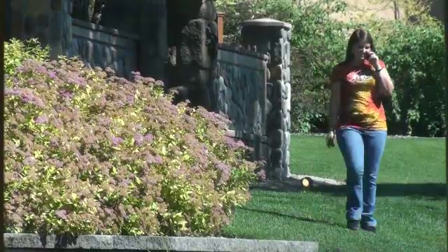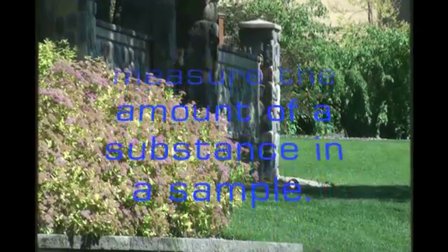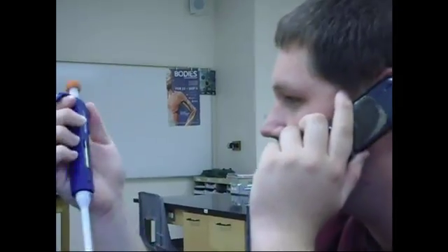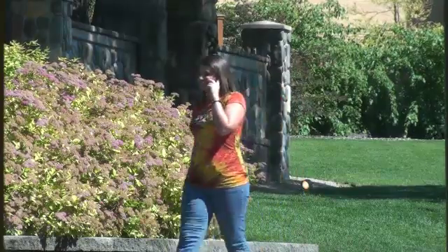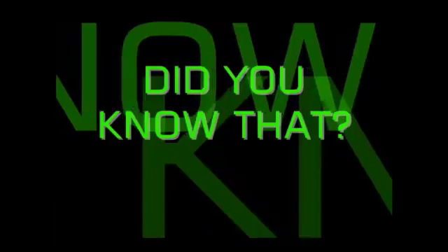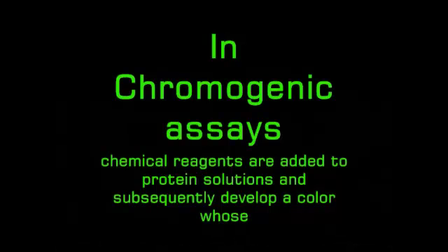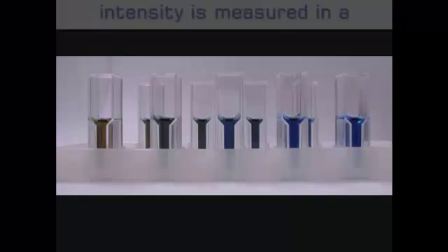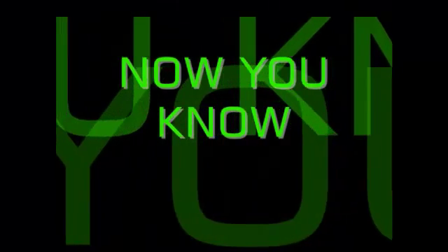It says I have to do something called an assay. Do you know what an assay is? An assay is a way to measure the amount of a substance in a sample. The one you're working on is for protein quantification, so basically I need to find out how much protein is in the sample. Yep, exactly. You're going to have to do two different chromogenic assays — the Bradford assay and the Lowry assay. In chromogenic assays, chemical reagents are added to protein solutions and subsequently develop a color whose intensity is measured in a spectrophotometer. Now you know.